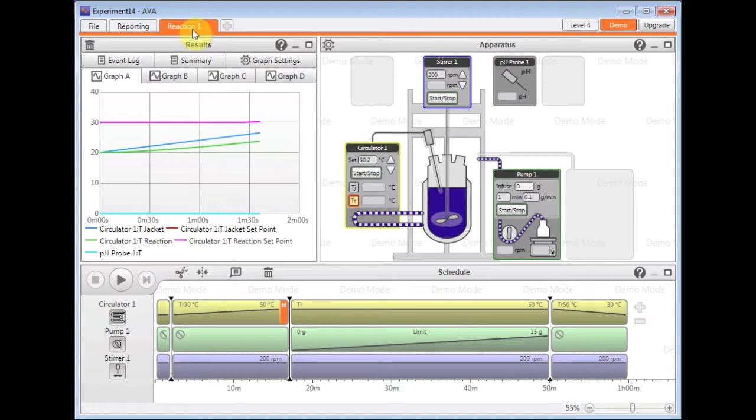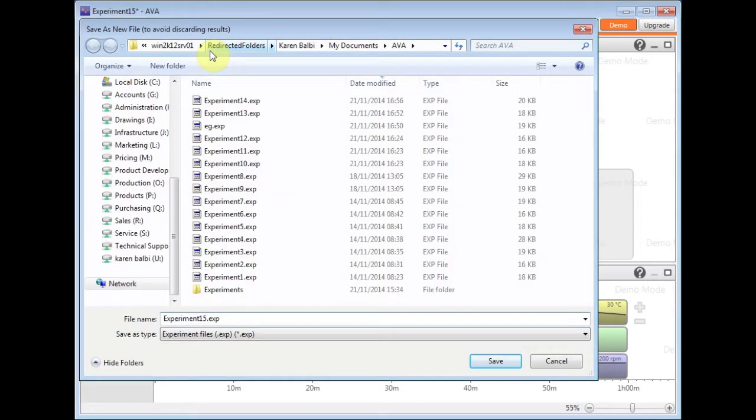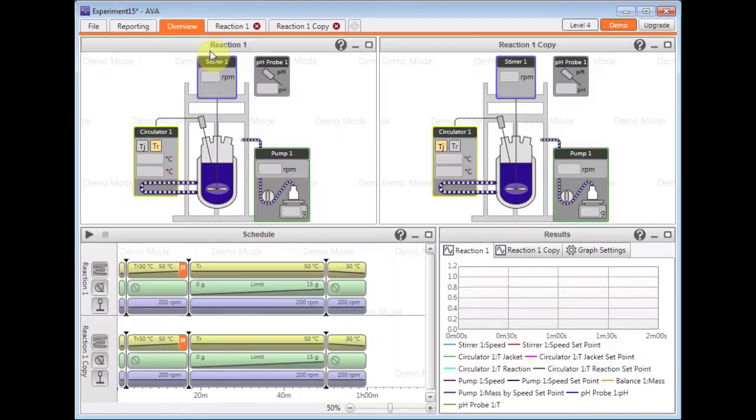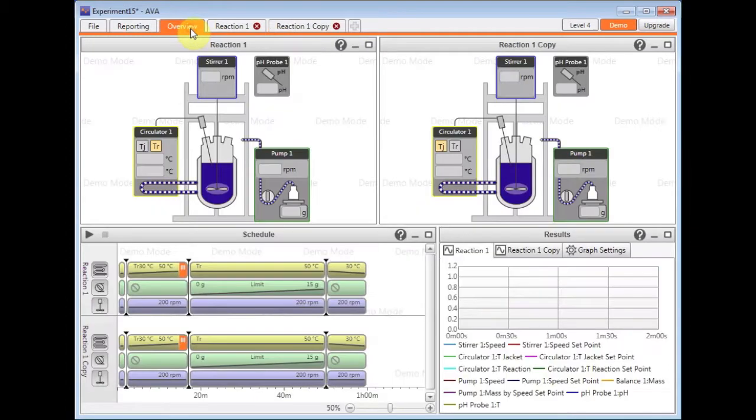So for example, if you wanted to control two systems the same as this, you can actually just very simply copy this setup by right clicking on the tab and selecting copy. And then you have two of the same with my overview window.